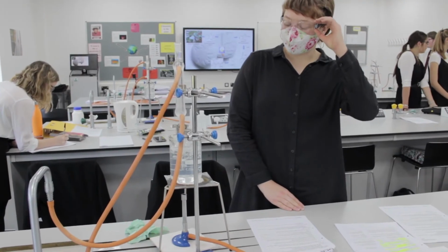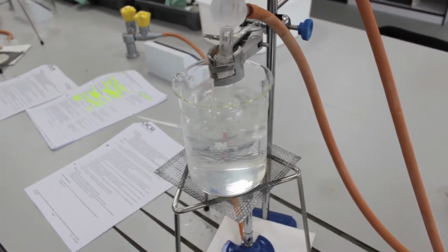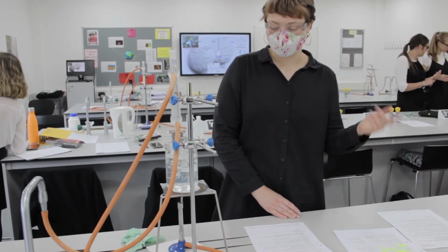We're doing the first step of making aspirin, which is refluxing oil of wintergreen with sodium hydroxide, and then that's going to create a sort of impure version of aspirin that has loads of other stuff in it that we then need to get rid of during the next steps.